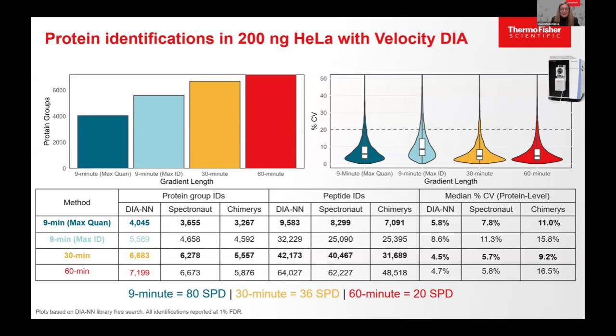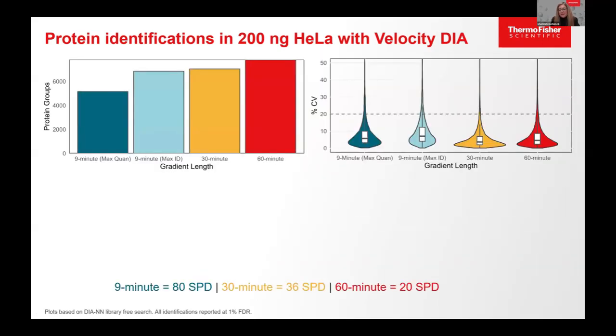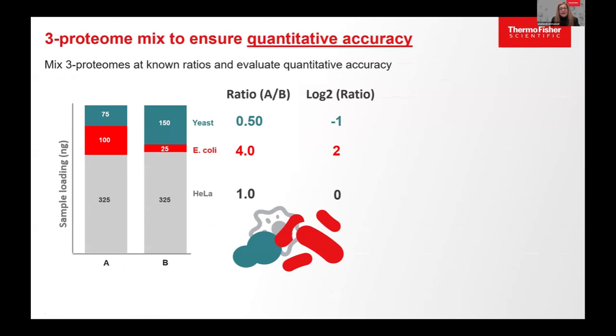Okay, I have a really good 10% CV. And the next, there's a similar performance for Ascent that is here, a 9-minute method and also a 60-minute and 30-minute method. Accuracy is still less than 15% CV, which is amazing. And then, okay, how does the accuracy perform?